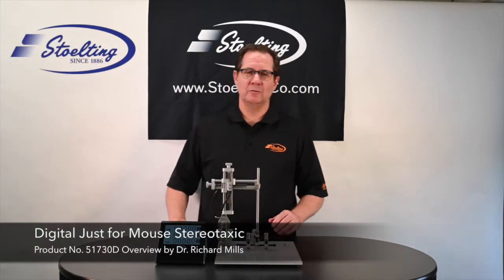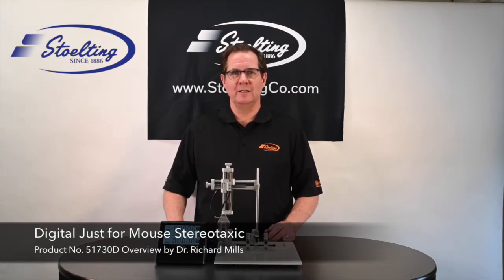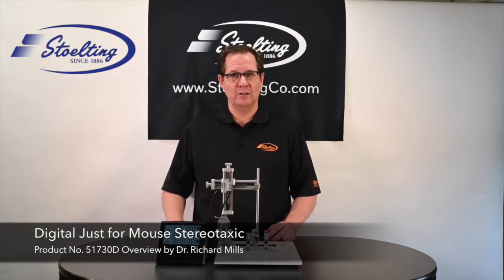Welcome to the Stolting YouTube channel. Today I'd like to be talking about the Stereotaxic Instrument 51730D, the digital Stereotaxic just for mouse. So let's get started.